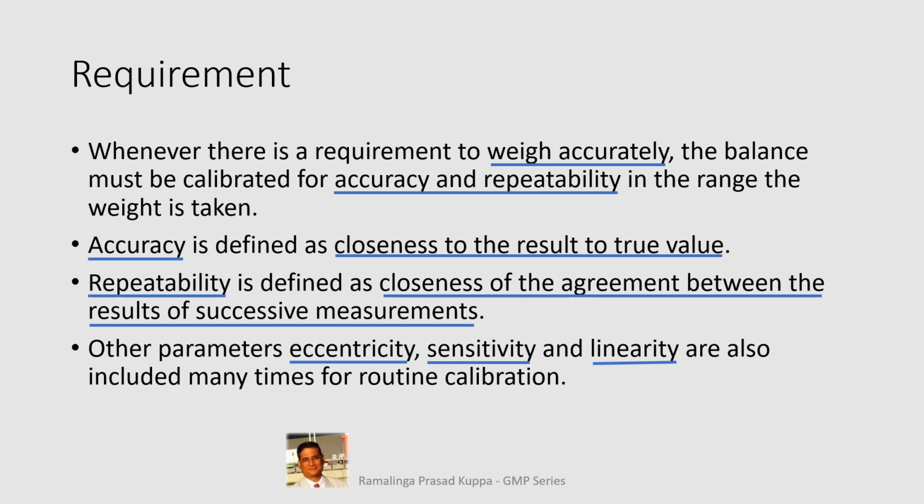The sensitivity of the balance is usually expressed in terms of the amount of weight which will cause the pointer to deflect or move 1/4 of a division on the index scale. Sensitivity is sometimes also expressed in terms of the change in the equilibrium point caused by 1 milligram.